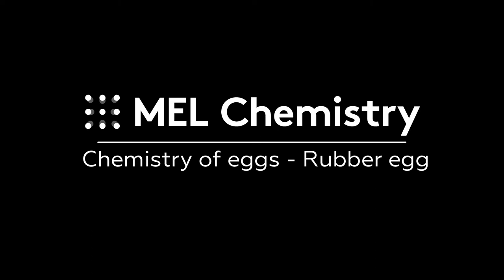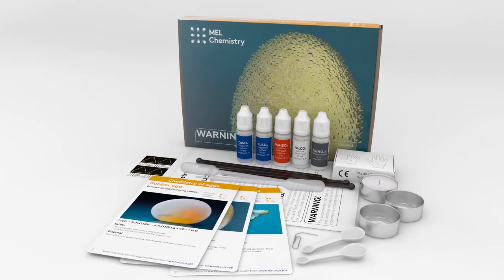Welcome to the wonderful world of chemistry. Today, with the help of the chemistry of eggs set by Mel Chemistry, we will dissolve the eggshell of an intact raw egg, with the result that the egg becomes like rubber.